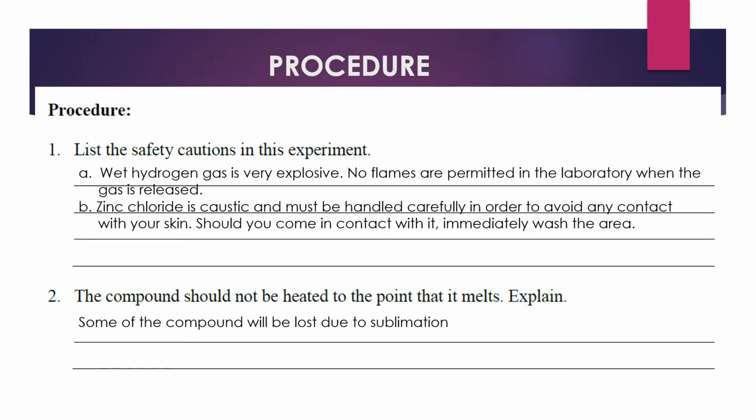Next, for the procedure you have 2 questions here. The first one, list the safety precautions in this experiment. Here, the first one is wet hydrogen gas is very explosive. Thus, no flames are permitted in the laboratory when the gas is released.